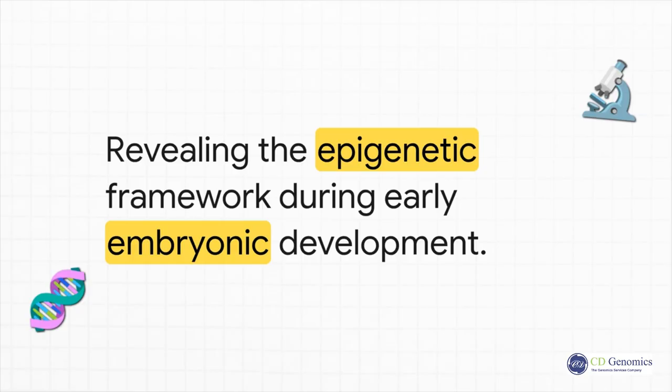For instance, researchers recently used CUT&Tag to map genome-wide histone modifications, specifically identifying marks like H3K27me3 and H3K4me3 across 7 distinct embryonic developmental stages in an aquatic model organism. And because CUT&Tag requires so little input material to work, they could finally analyze the true chromatin state dynamics of these early, super-fragile embryonic stages that were previously just completely off-limits to researchers.